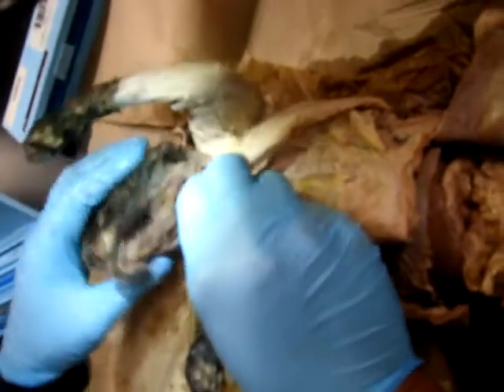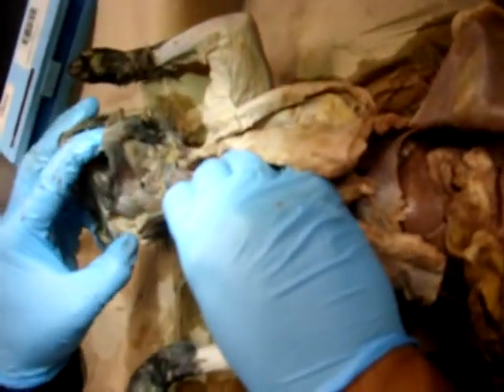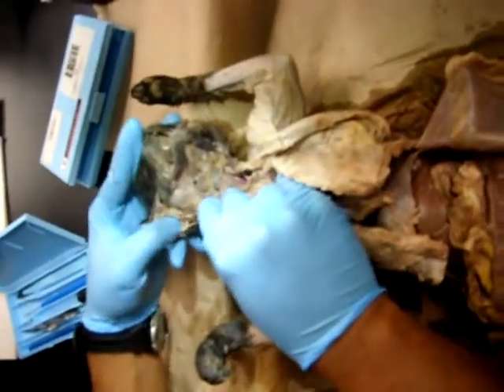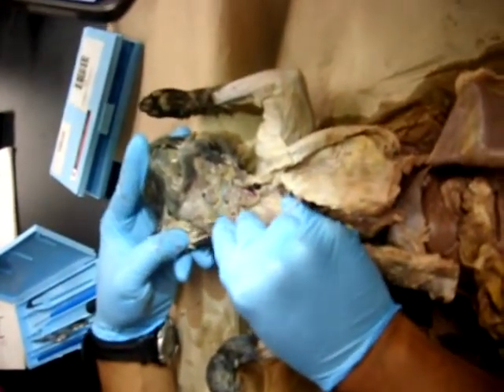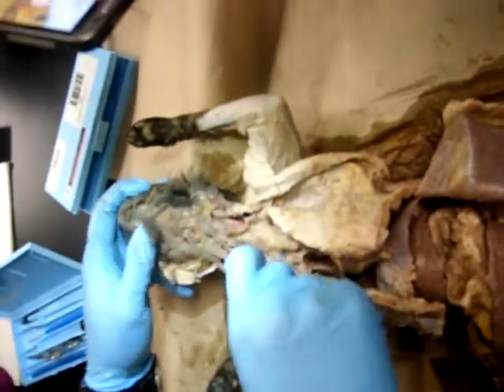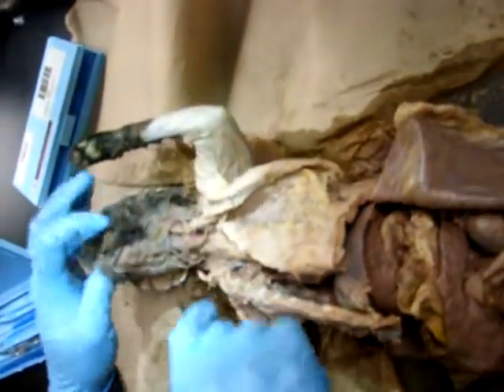Oh, that is a lymph? Yeah, big lymph node. We won't have to worry about the salivary gland. Well, salivary glands are here. Here's one of the salivary glands, the parotid, right there. You won't have to worry about the submandibular or sublingual because I removed most of them right there.